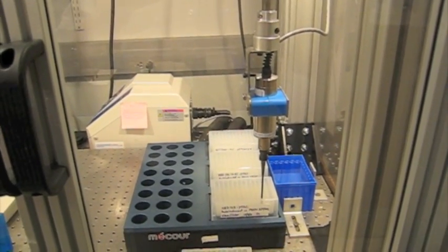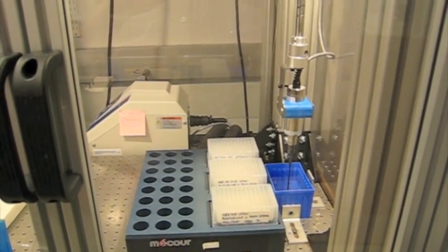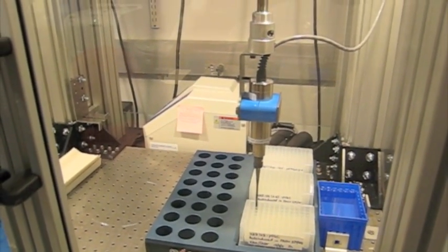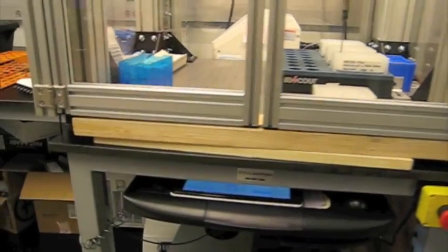This is Susie, our Sonicator, working on three 96-well plates, which are mounted on a chiller block to maintain a constant four degree temperature by the chiller below.